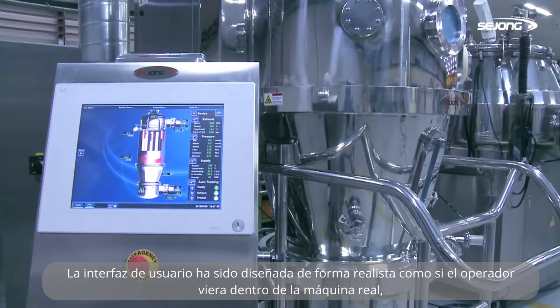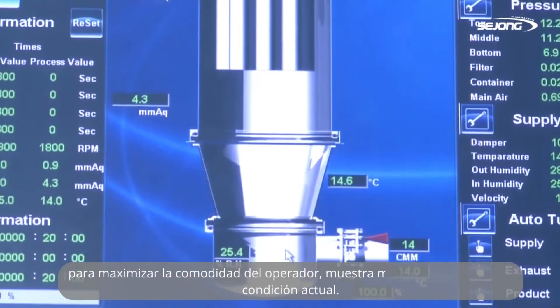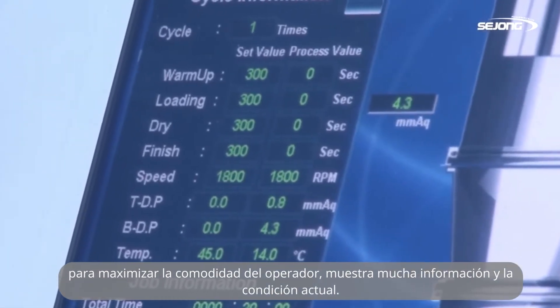The user interface has been designed realistically, as if the operator sees inside the real machine. To maximize the convenience of the operator, it shows much information and the current condition neatly.